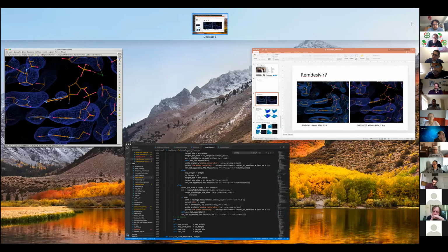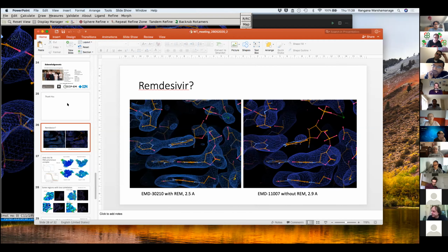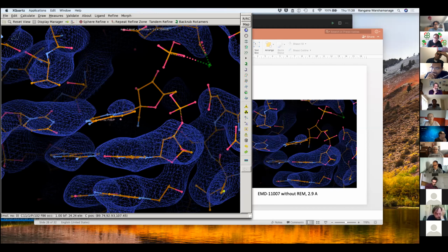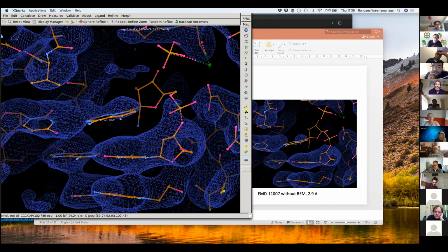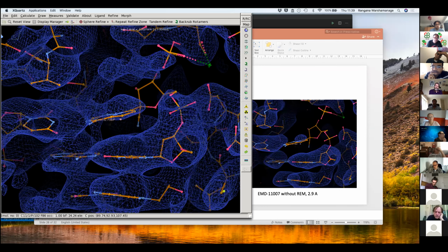Please don't forget, here is the code. I can pull it out, one second. Since I'm working on two screens, it's not easy. It might be that the adenine in the RNA, in the second, I'm going down to the low level. Yes, it's interesting. This is the structure that shouldn't have any density, but there's something bleeding here.